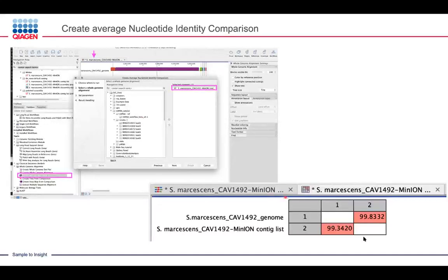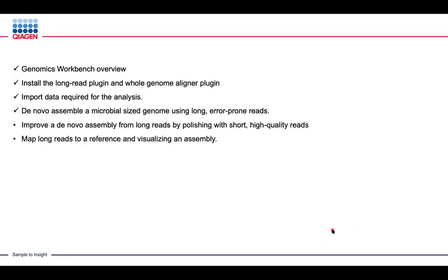And so when we look at this, we had the average nucleotide similarity, if you will, or identity, where it was 99.8% the same. And then we only covered, though, if you look at it, slightly 99.34% of the reference genome effectively. So how can we improve this?